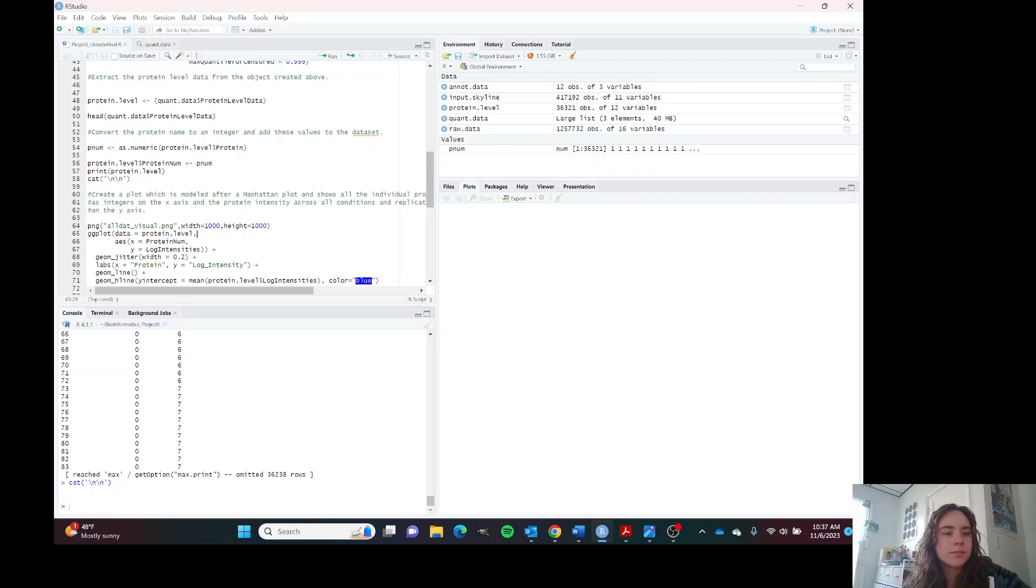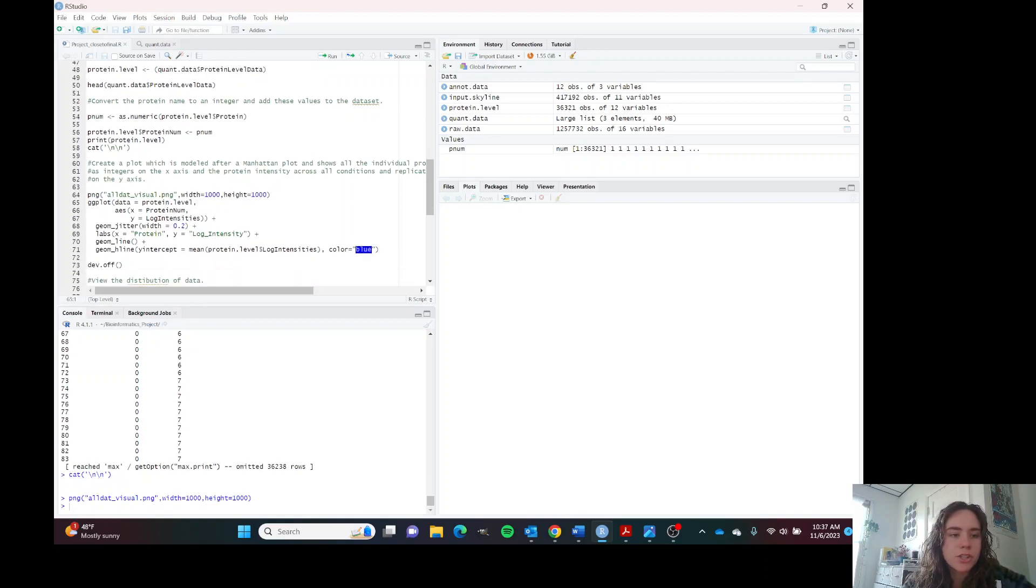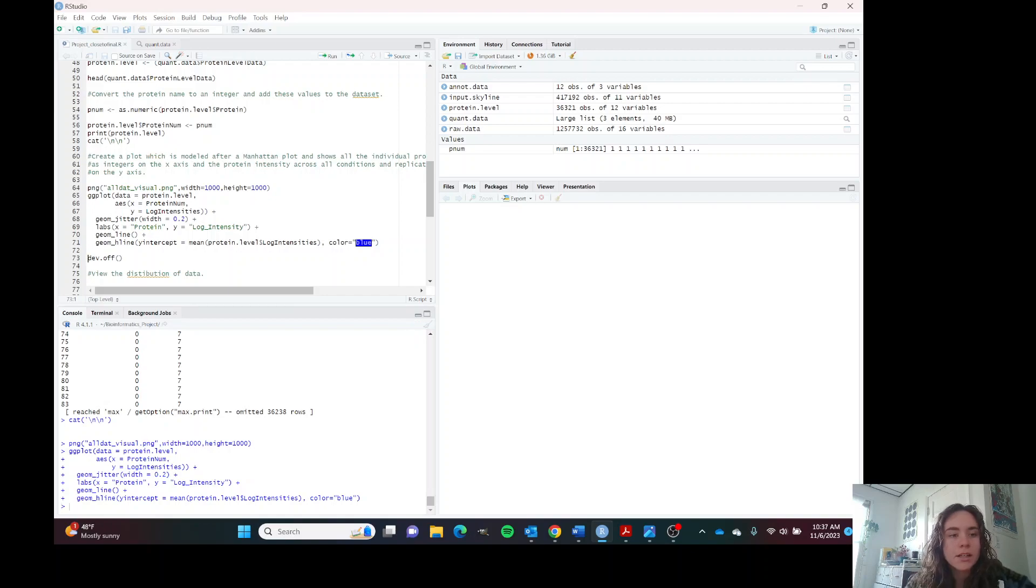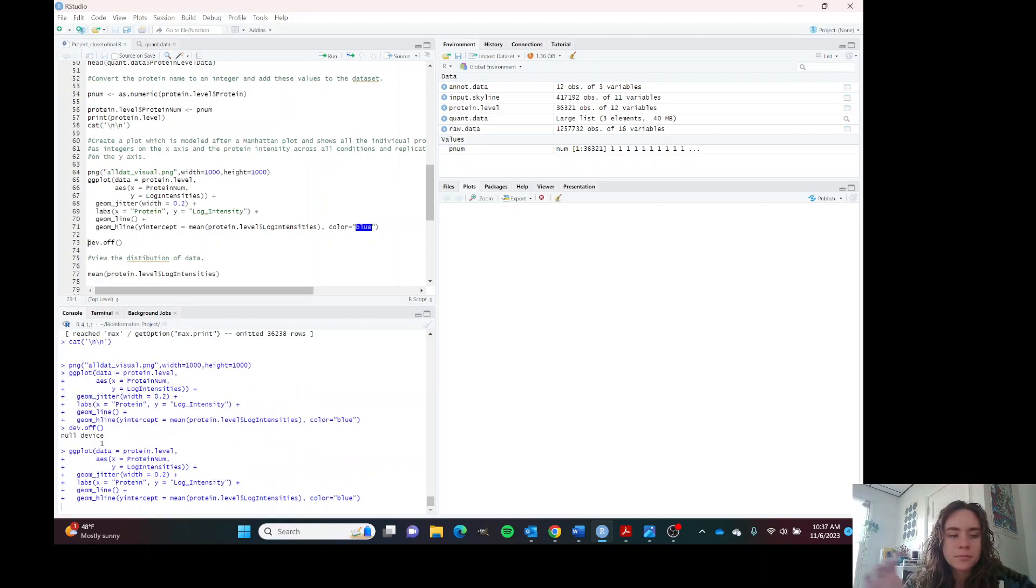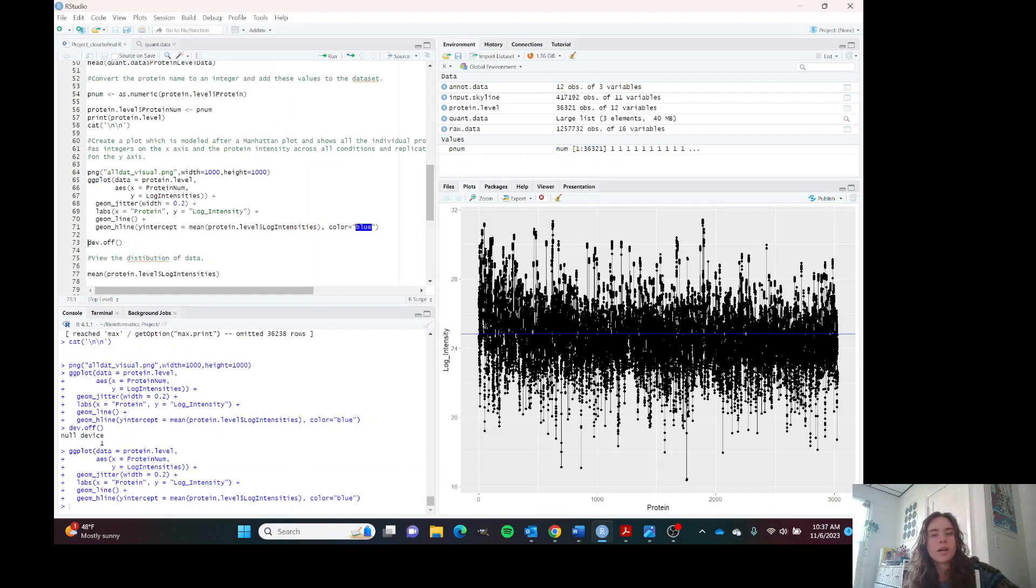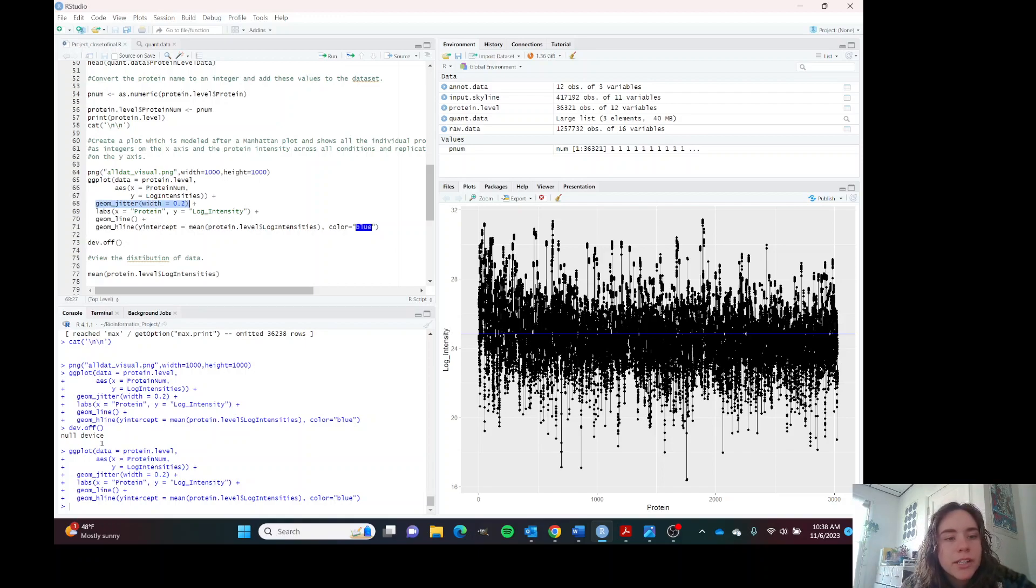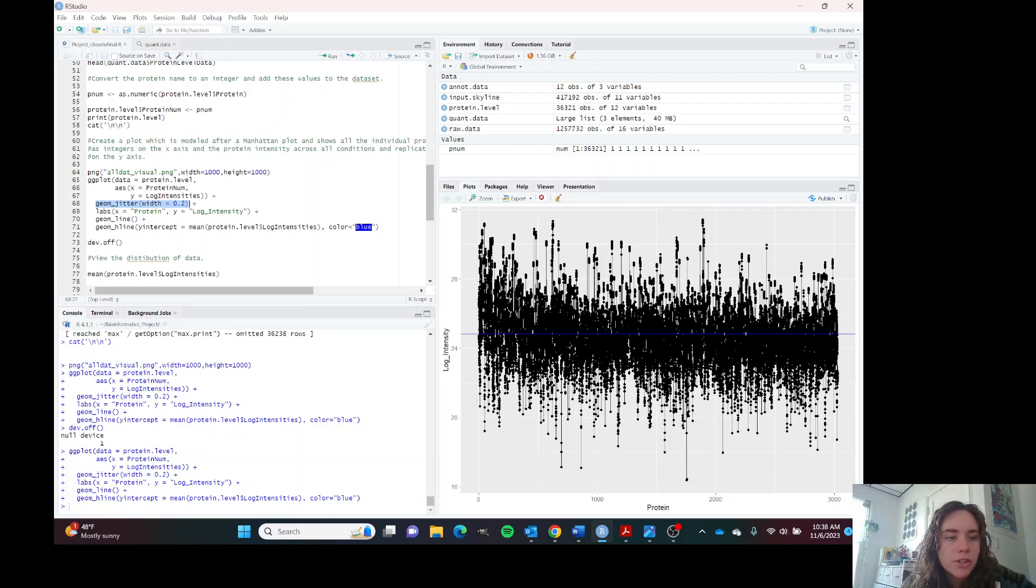Now we can create our plot. I'm going to run this plot and while it's doing that I'm going to talk about what it should look like and why. We're using our protein level data. Our protein numbers are on the x-axis and our protein intensities are on the y-axis. This allows us to create some randomness with the plots so that we can see more individual plots because a lot of them are on top of each other.